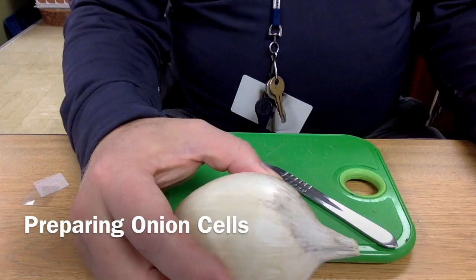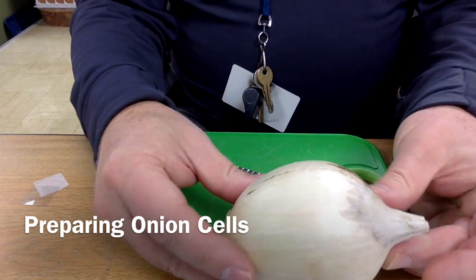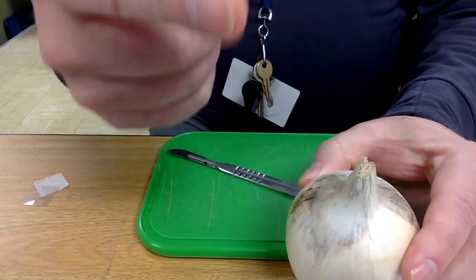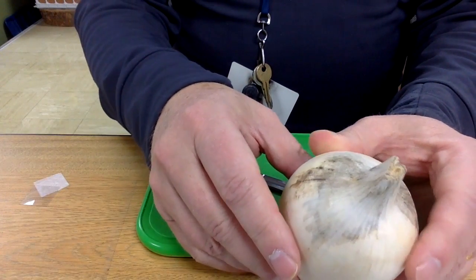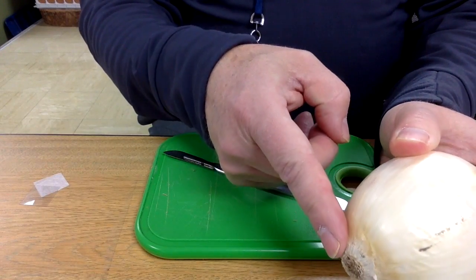Today we'll be preparing some onion cells. This part of the onion grows below the soil, heading up to the stem leaf, with little roots coming out of here.